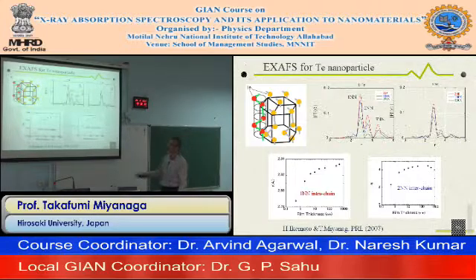The interesting result is here. After the curve fitting, we obtain the interatomic distance of the intrachain first nearest neighbors. In the bulk state, the distance is around 2.83, which is a typical length of the tellurium compounds. As the thickness or diameter decreases, the intrachain distance also decreases. So it means the breakup of the interchain correlations, and the bond length decreases and the bond strength is increasing. Below about 10 nanometer thickness, it steadily goes down.